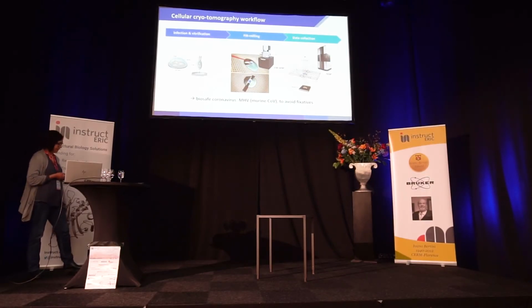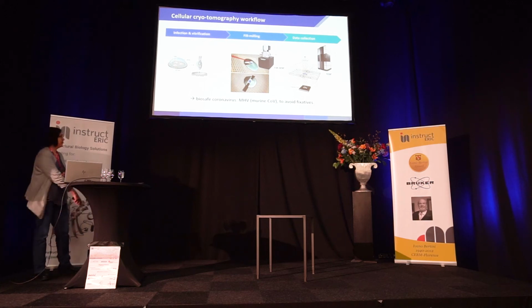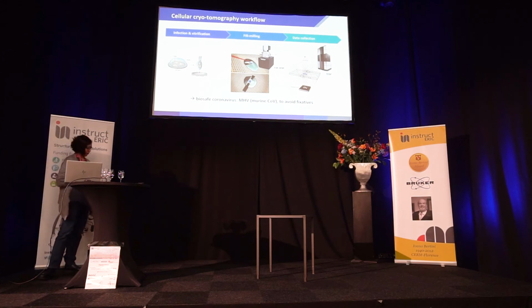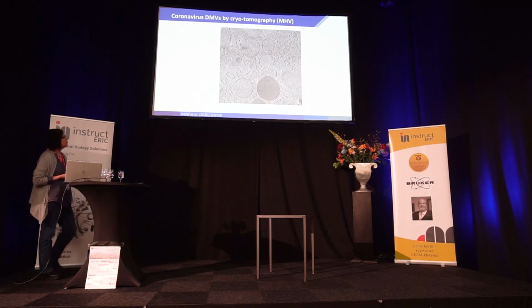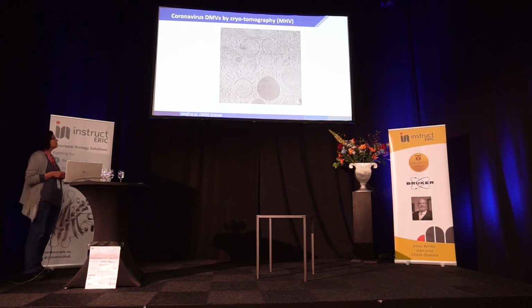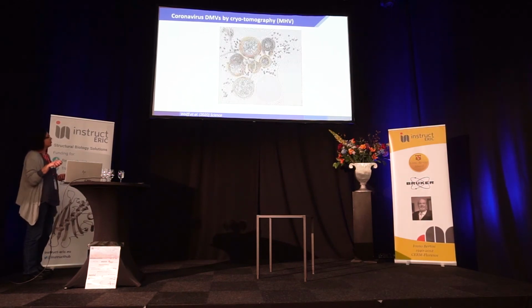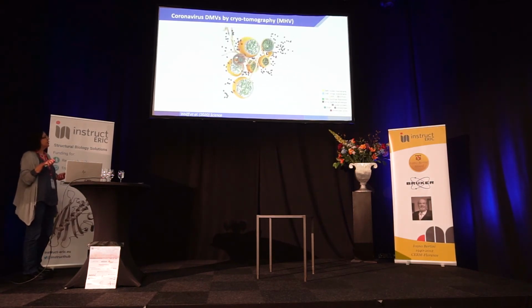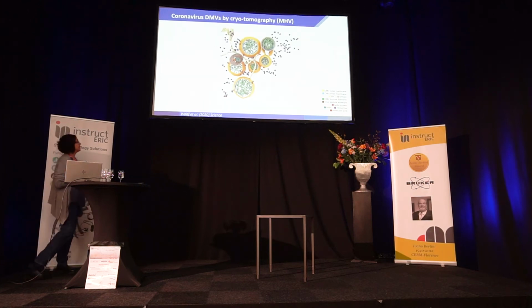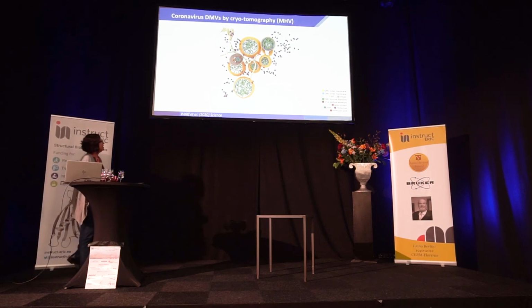And then we decided to focus on a biosafe coronavirus, MHV, which is only BSL-2, so we could visualize infected cells without any treatment. I'm going to show you now one of the tomograms that we collected, and for us it was beautiful. You can see these DMVs and a lot of macromolecular detail, like fibers inside these DMVs, which we know, at least for a large part, have to be double-stranded RNA. There are the connections with the ER, and here in the segmentation model, you can even see a virus particle that was in this area.